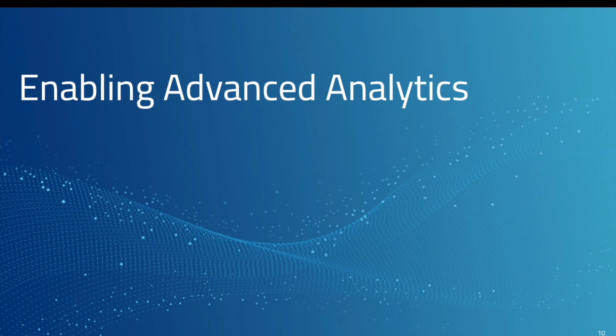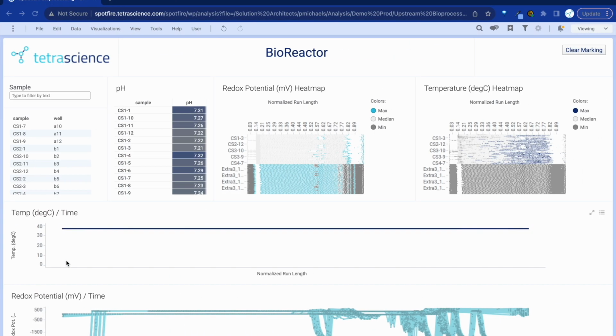Now I'm going to show you a dashboard that we created on upstream bioprocessing data as an example of what an endpoint can look like with Tetra Science. We're looking now at a Spotfire dashboard that has been built on top of Tetra data and using the SQL endpoints from the Tetra data platform. This is a near real-time dashboard that can be refreshed within minutes of results being captured.